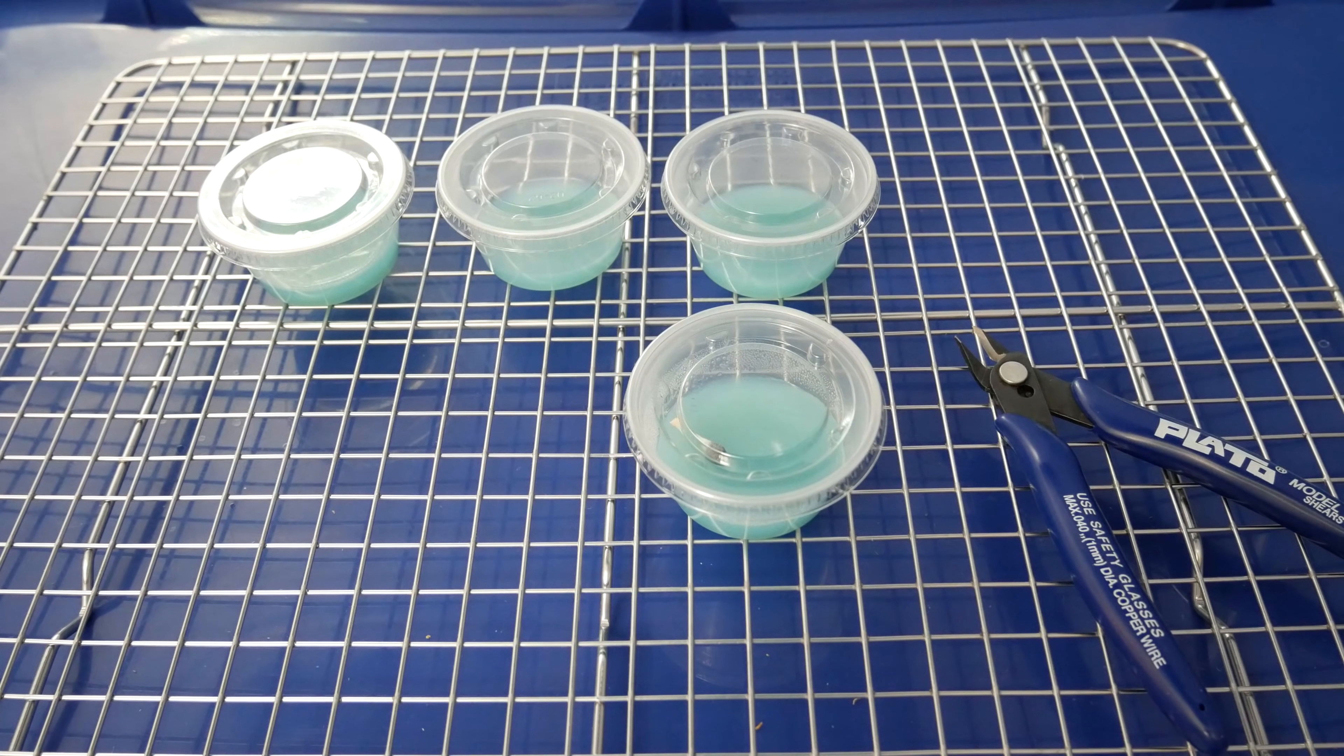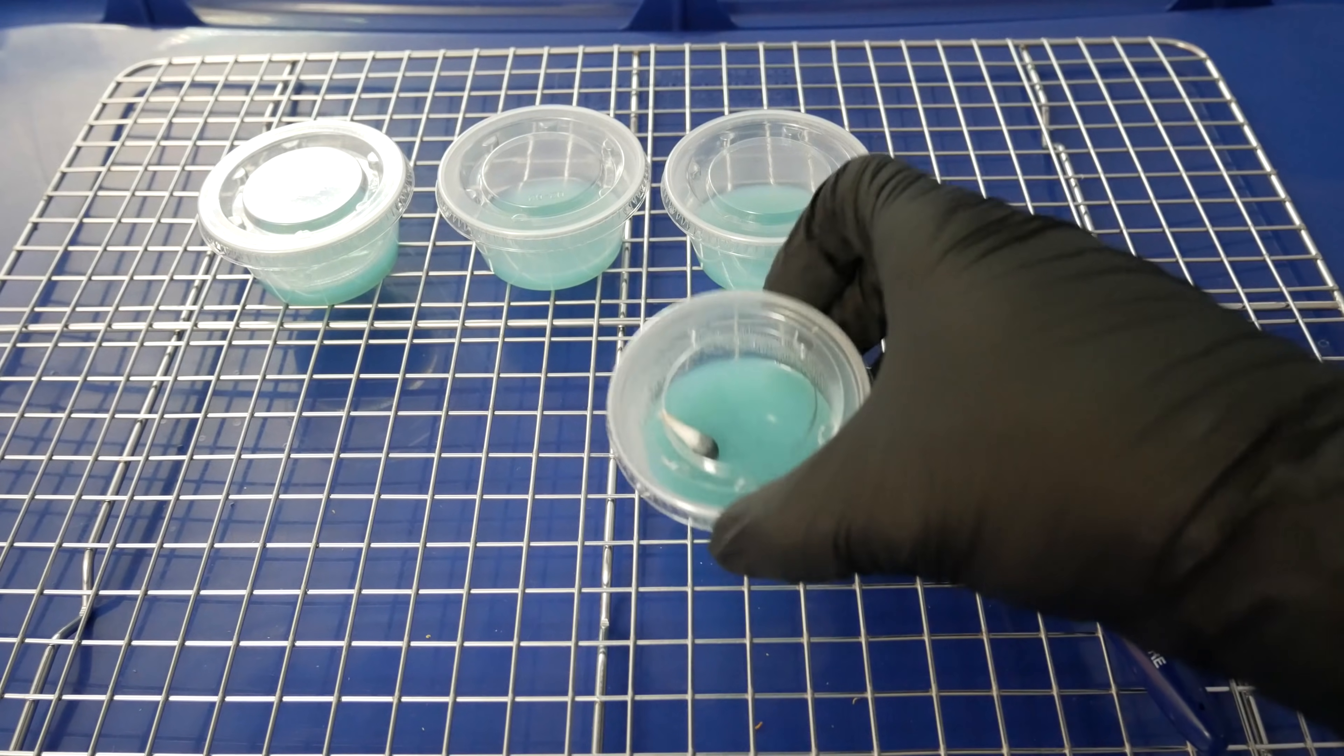After you're done inoculating your agar dishes, we'll go ahead and leave these out to incubate at room temperature. So you want to be somewhere between 70 to 80 degrees Fahrenheit or 21 to 28 degrees Celsius. We'll check back to these in about a week or two and you should see some mycelium start to germinate from our spores.